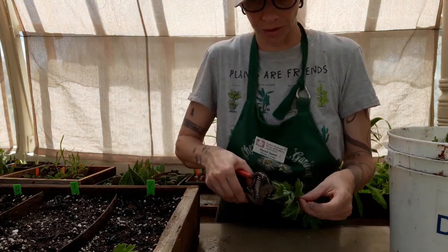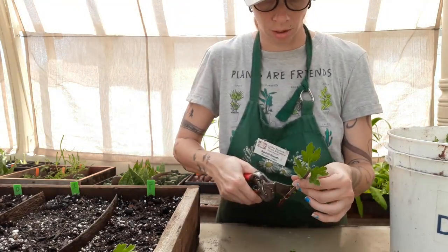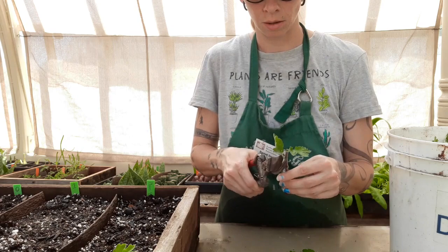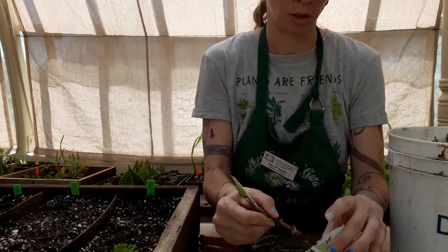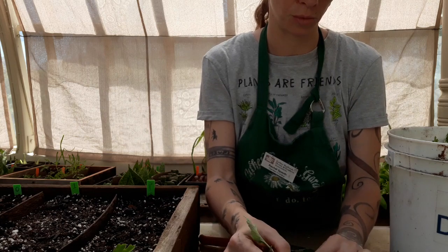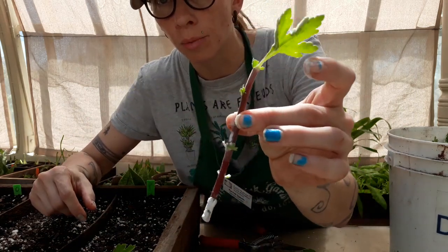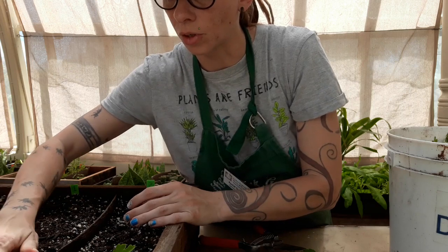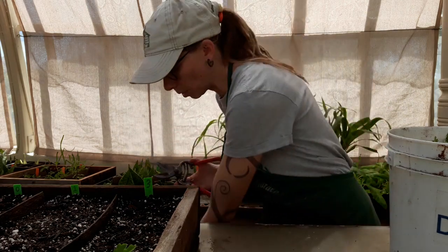That cutting takes off the terminal growing point. Now let's do an example with one leaf on top — six nodes, with one leaf remaining. Here is our stem cutting with one leaf, three nodes down that'll go under the soil and three nodes above. That's consistent with the first one.